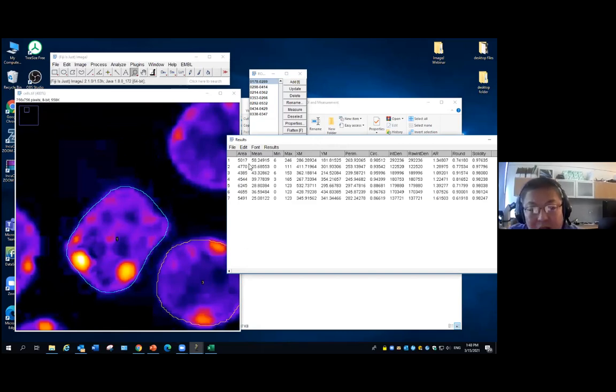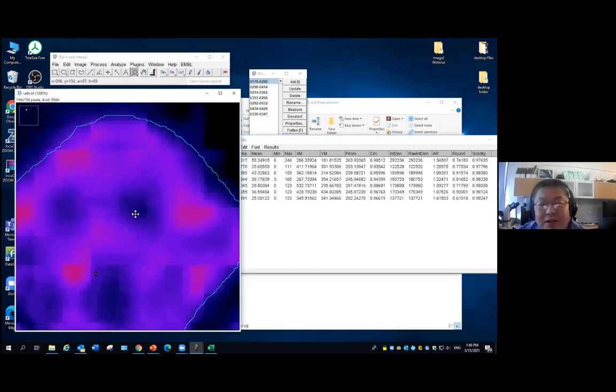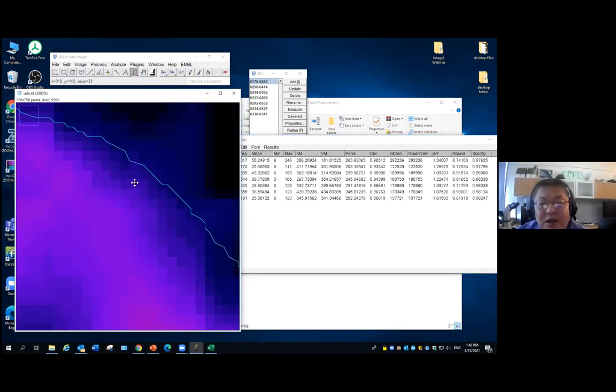So you wonder, what is the unit of it? Normally when we measure the cell size, the unit is probably micron square. That's what you want. But here it's all very whole numbers. So this means we actually don't know how much the size is in the real world. We only know how many pixels it is. As you can see, when you zoom in more, you begin to see the individual pixels.